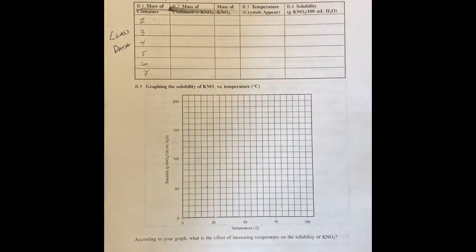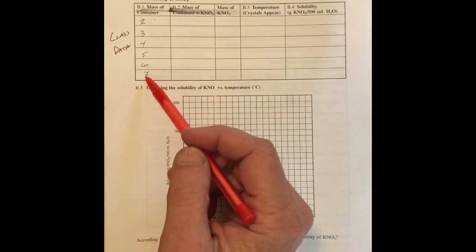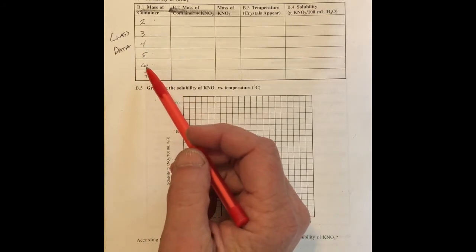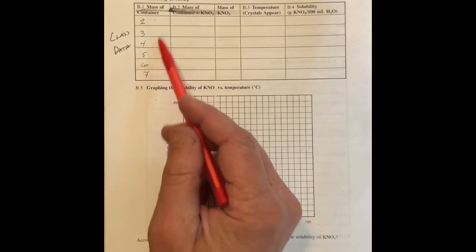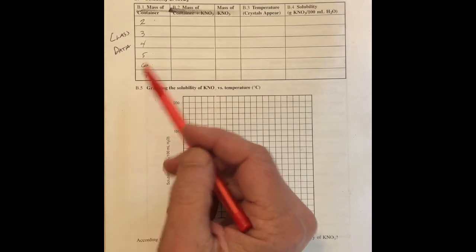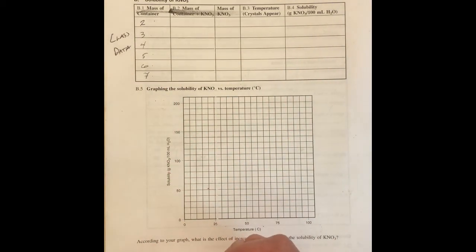In the second part of the lab, we're taking potassium nitrate, which is a very soluble salt, and seeing what the solubility is in water as a function of temperature. So you're taking a relatively small amount of the potassium nitrate, we weigh it out for you, 2, 3, 4, 5, 6 grams, and adding it to 5 mils of water, and then we're going to eventually convert that to a solubility, which is defined as grams of solute in 100 mils of water. So all of these masses get multiplied by 20 to go from 5 to 100 mils of water, and that's actually what gets plotted as the y-axis.